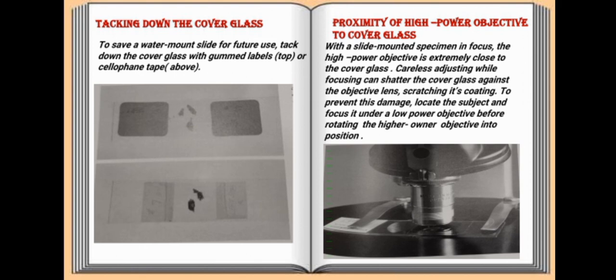To prevent this damage, locate the subject and focus it under a low power objective before rotating the high power objective into position.